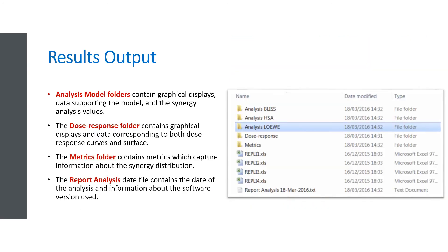Once the analysis is completed, all the results will be saved in several new subfolders in the same folder of the original input files. The Analysis Model folders contain graphical displays, data supporting the model, and the Synergy Analysis values. The Dose Response folder contains graphical displays and data corresponding to both dose response curves and surface, including the measured effects for the two drugs used as single agents and in combination. The Metrics folder contains metrics which capture information about the Synergy distribution, such as maximum, minimum synergy, and more. The Report Analysis Date file contains the date of the analysis and information about the software version used.